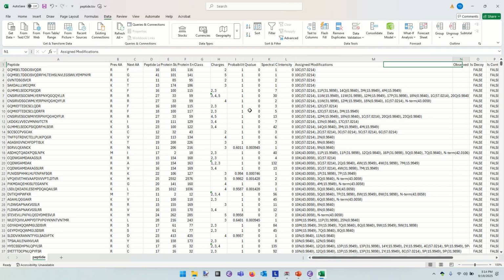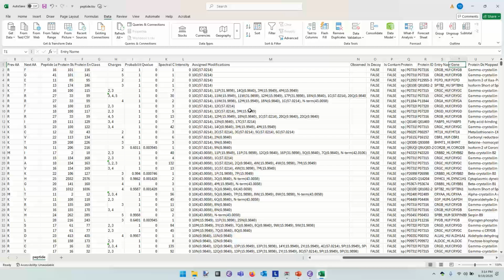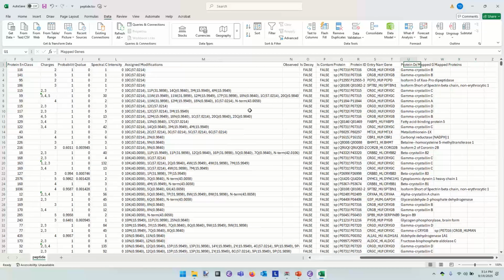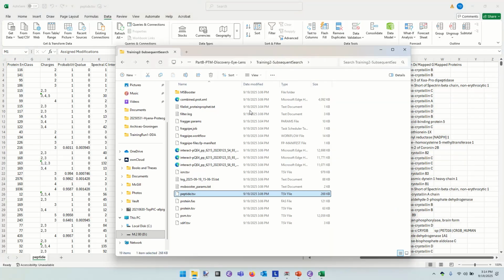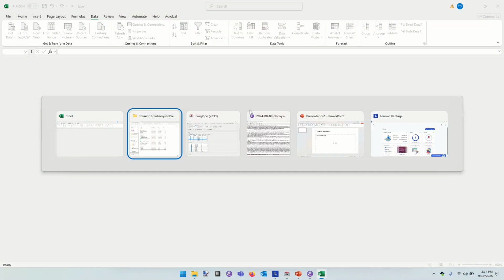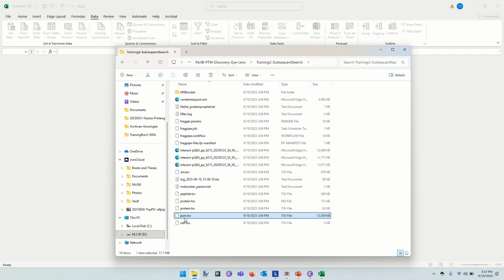But I'd like to see information about the localization certainty. And it doesn't seem that this table contains it. That's really unfortunate. That's possible. Oh, yes, of course. Yes, since each of those rows could correspond to multiple PSMs, that may be the answer.